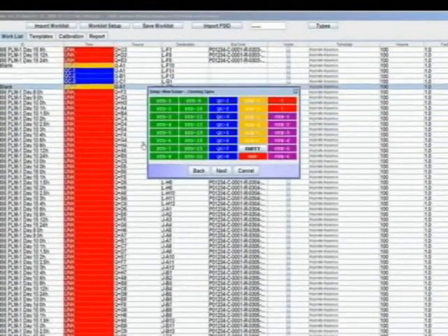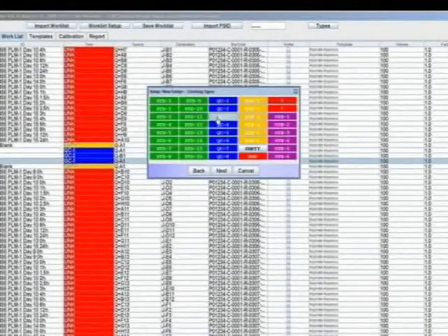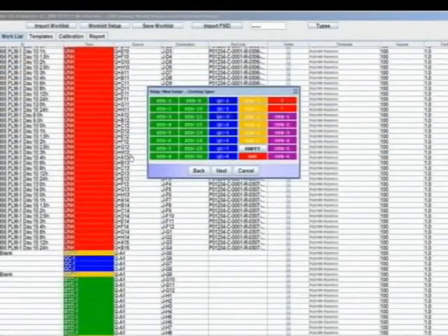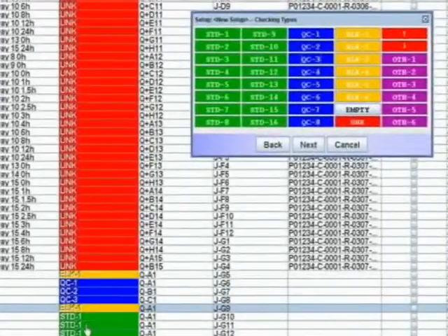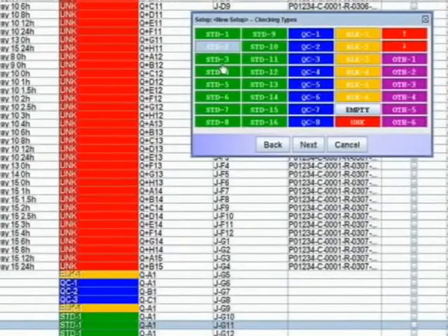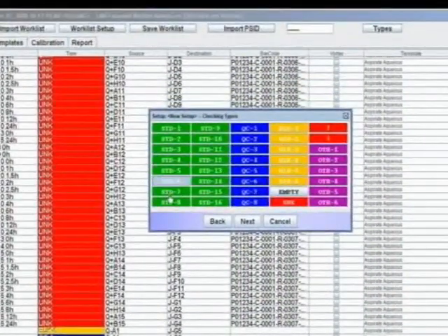If 2 or more samples have the same type name, they will be treated as replicates. One cryovial is opened and it is accessed with the same tip for all replicates. A single name implies a single source and a single destination. The exception are those samples marked unknown. They are all treated as single samples.